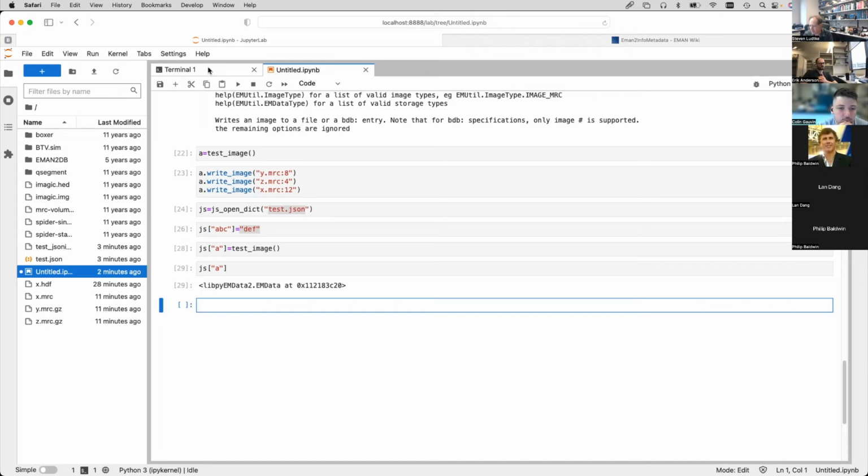But in that intervening time, of course, we continued with EMAN2. So we were using this BDB format for everything for a long time. This was terrible because you couldn't look at the BDB files directly. You had to interact with them with programs. So that meant that a user who wanted to vi their file or something couldn't do it. And people found it really frustrating.